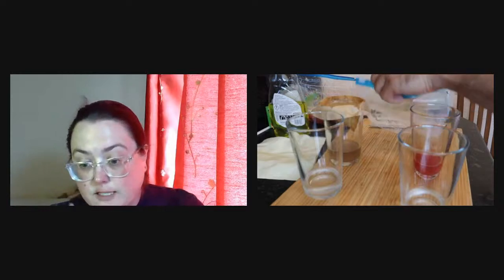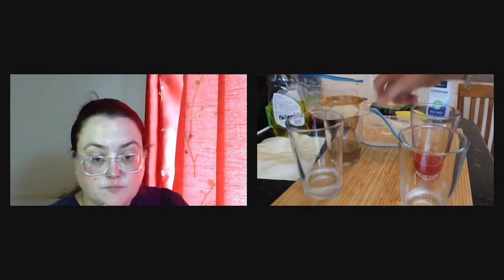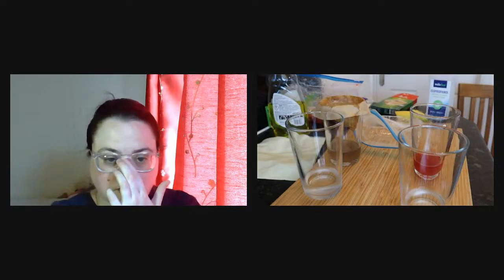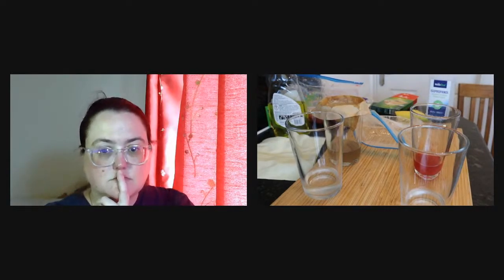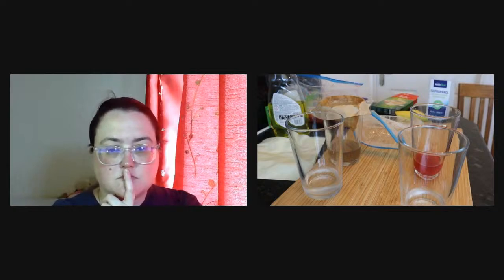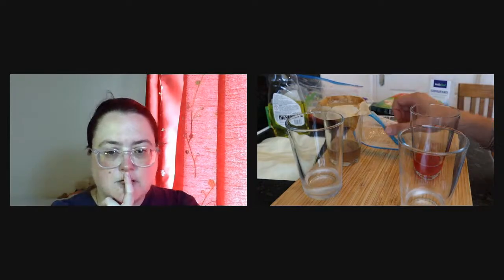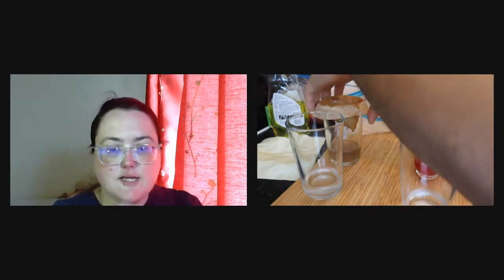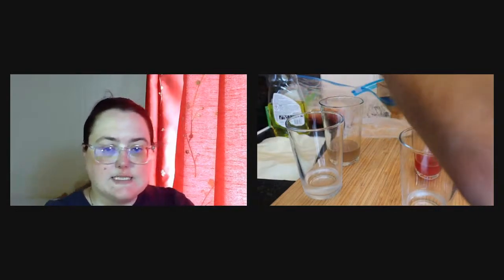So we have a question in, Remy. Where can we get isopropanol from? So I order isopropanol from Amazon. It is a cleaning product, so you probably need to go to a specialist for cleaning products, and you will be able to order that. But Amazon sells everything, and it's available there quite easily.